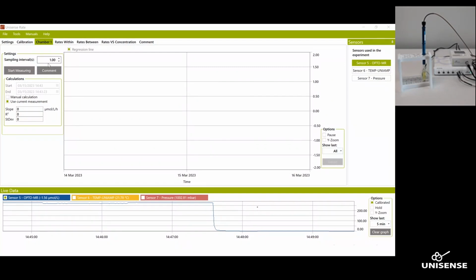When you're using optodes, this can also be quite relevant because then you will save the dye. There's a certain number of data points coming with an optode. Okay, but I will go to the camera again, and then I'll prepare a yeast solution that we can measure.